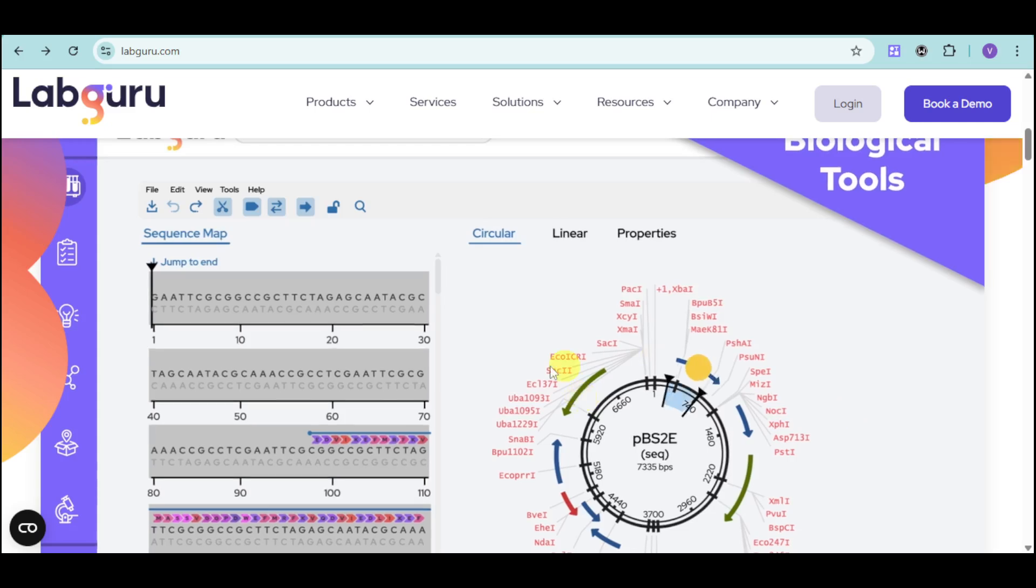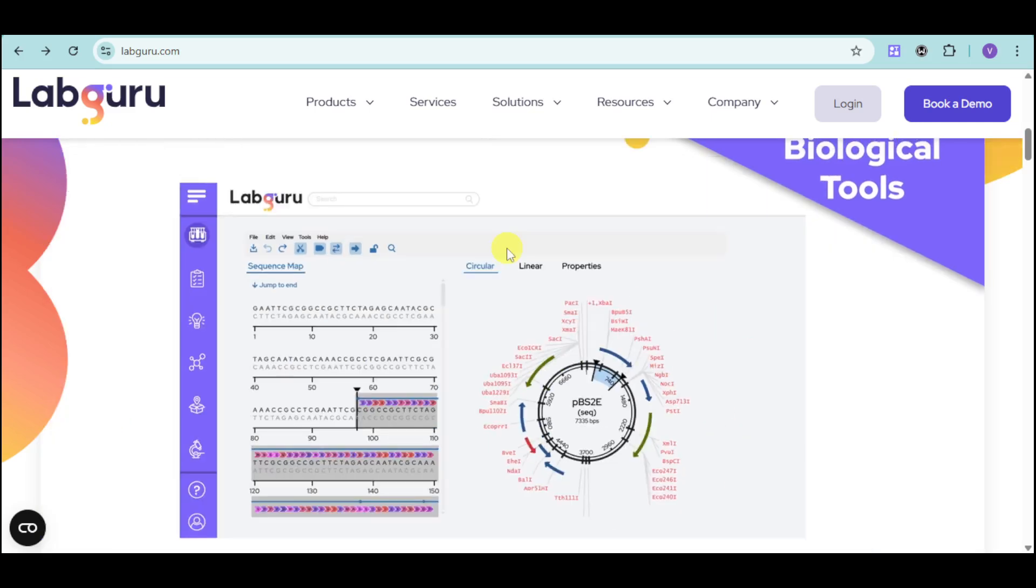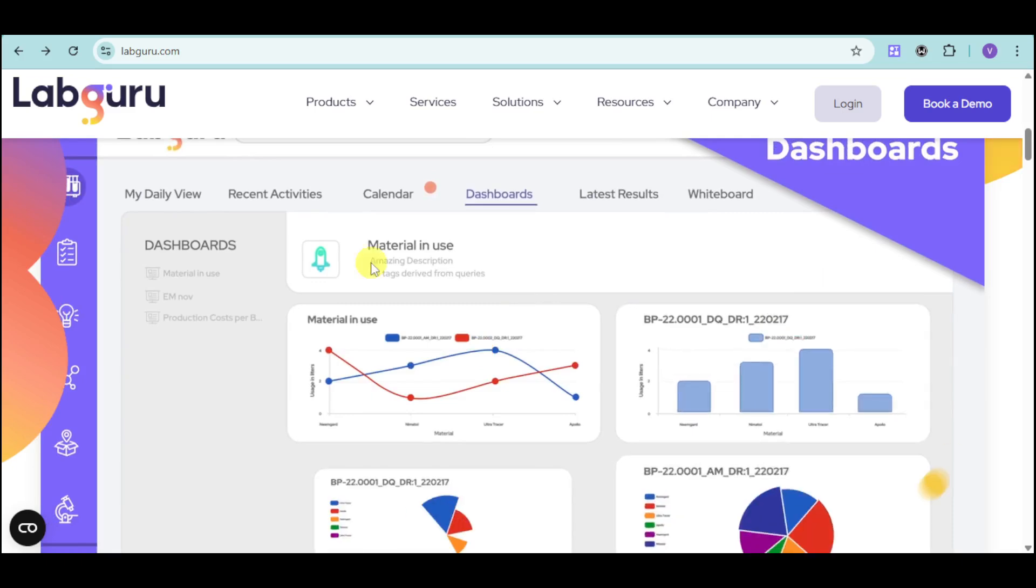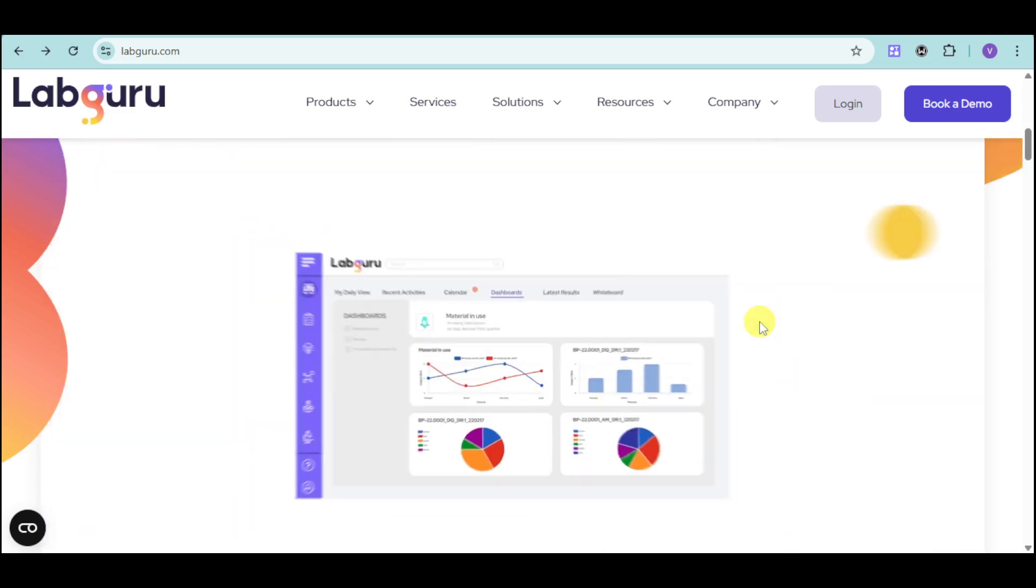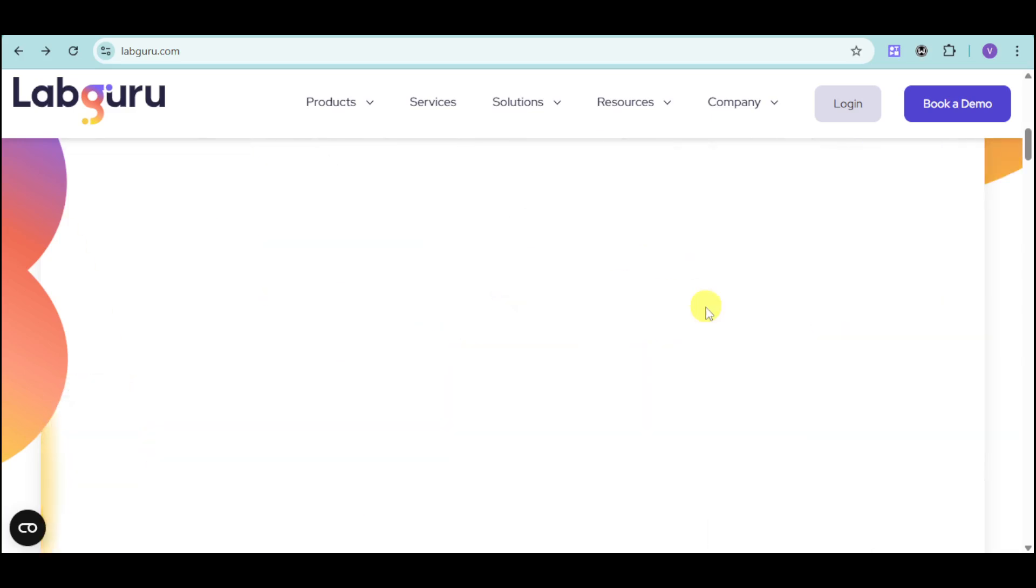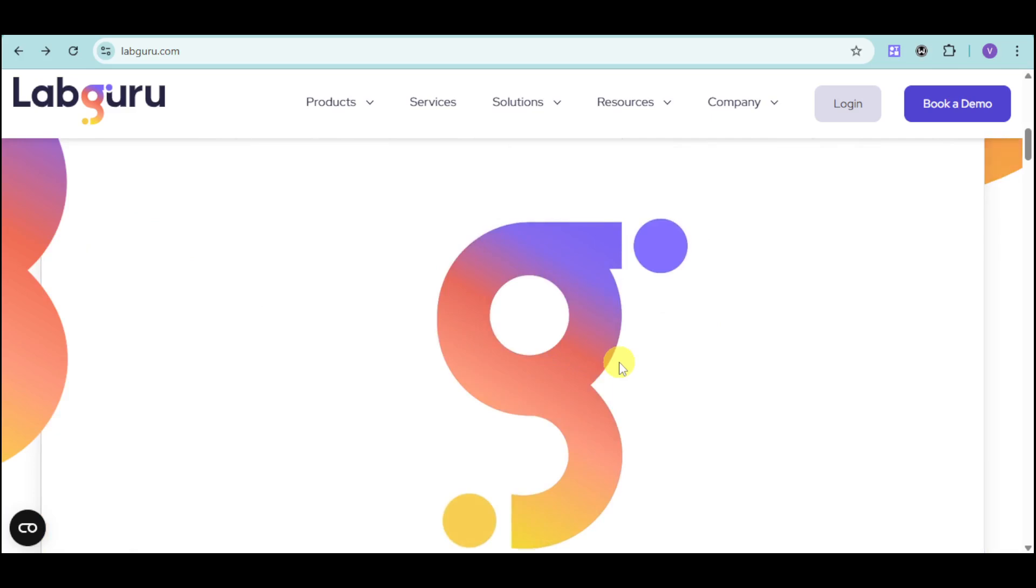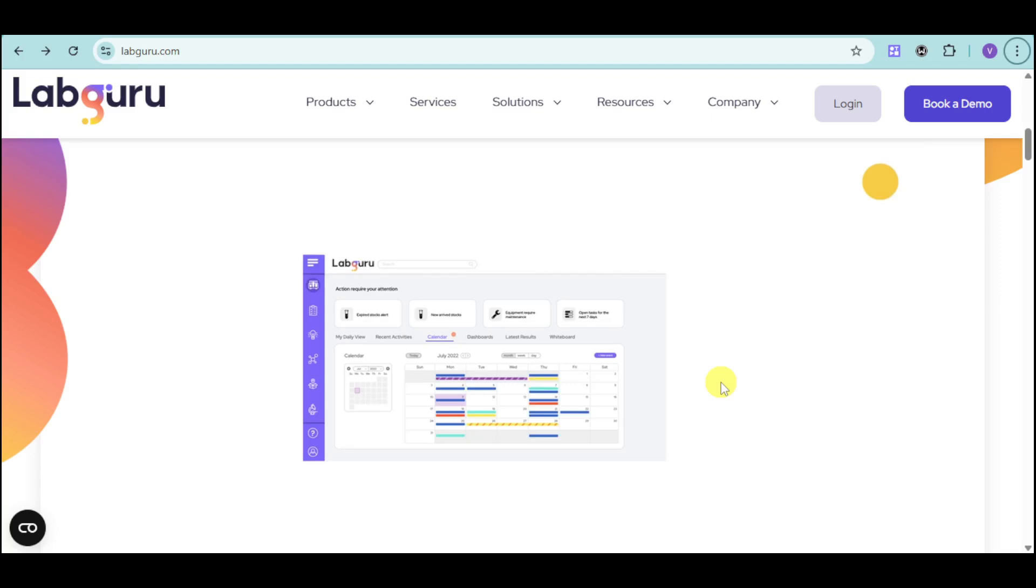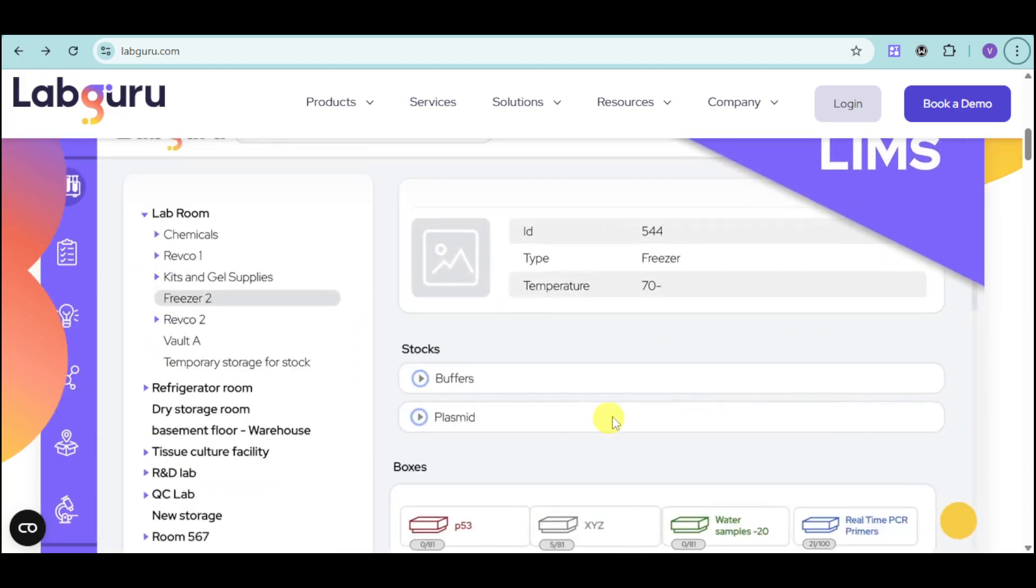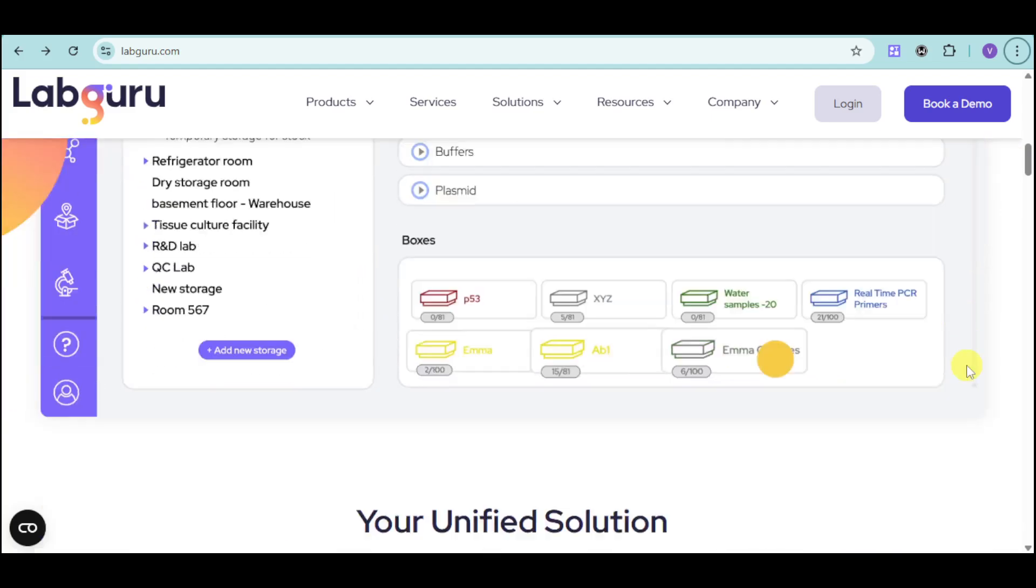We also have the sequence map, the circular lineal, and our actual dashboard overlook. LabGuru has it all in just their platform. We can see that we have a calendar as well that can help us, and a lot more things.